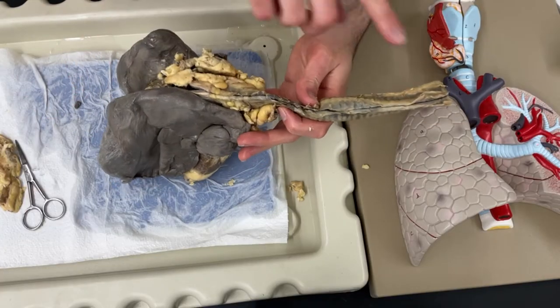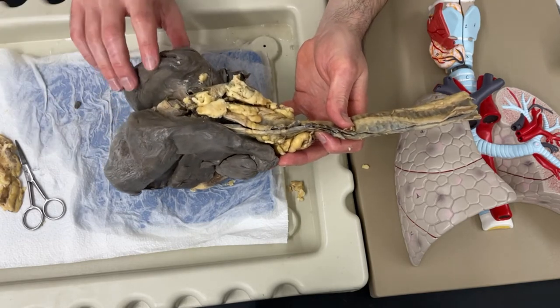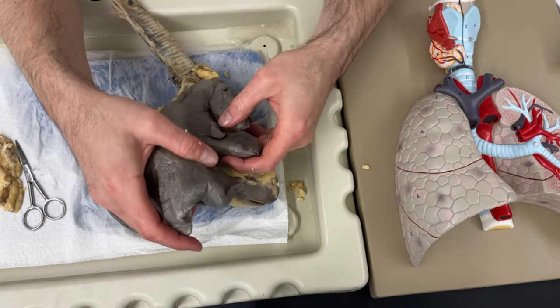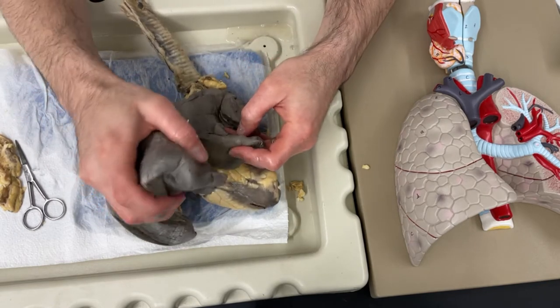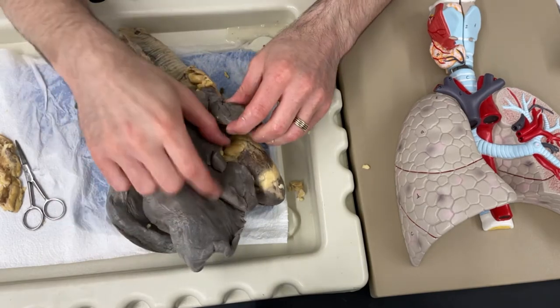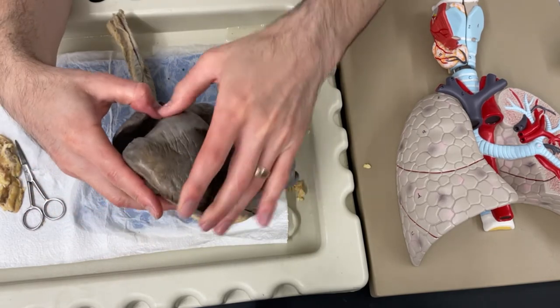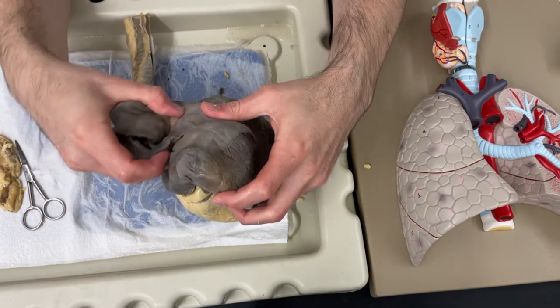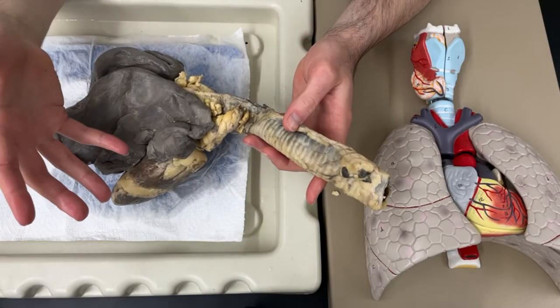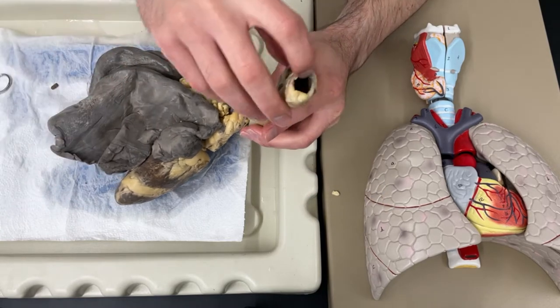So if you find where the head of the sheep would be - this would be the head of the sheep - that means this is the sheep's right lung and this is the sheep's left lung. There should be three lobes on the right lung: I've got a lobe here, a middle lobe, and the upper lobe. And then I should be able to find two lobes on the left lung. You also might notice that I'm not wearing gloves - it's totally fine, though if you're more comfortable wearing gloves, that's fine too.